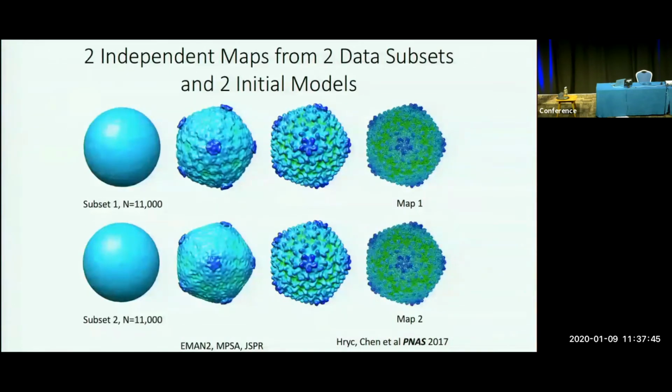It has been a tradition in, I would say, more than 98% of published cryo-EM data to have these 2 independent sets. But even today there are still publications with only 1 data set. I don't know how it gets published, but there are ways to get published anyway. I think the best practice is to have 2 independently determined data sets.